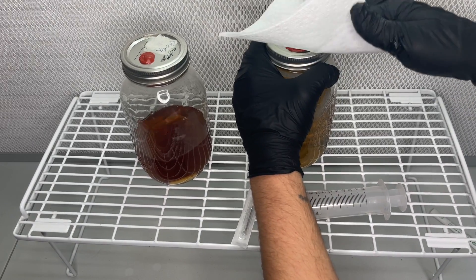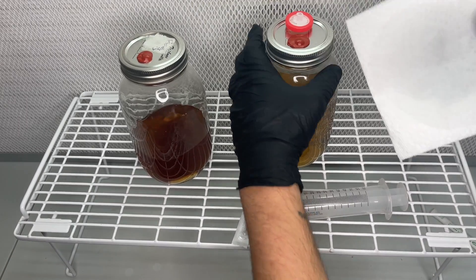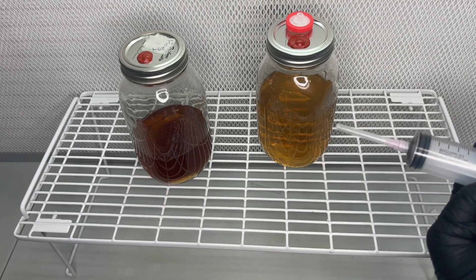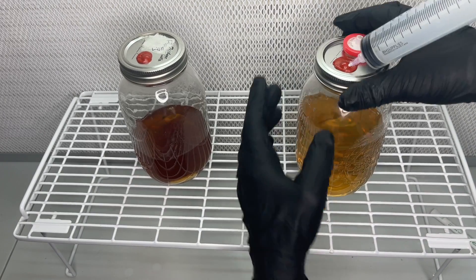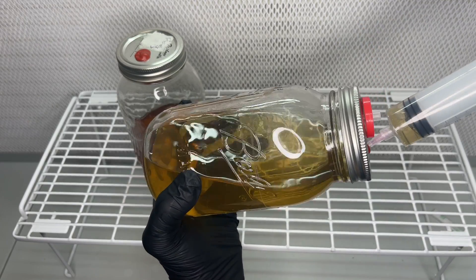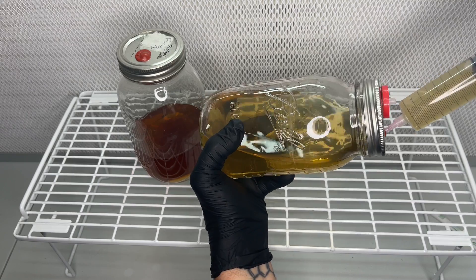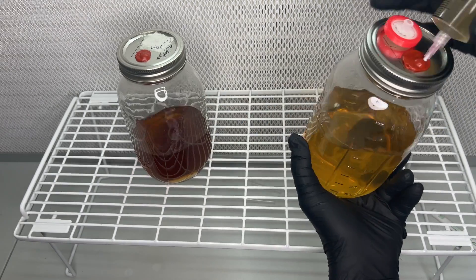Here is the fresh jar of honey water which you can see has a much lighter color. I used the same 60ml syringe and a new needle to extract the 240ml of fresh honey water and then inject it into the jar of stalled Lion's Mane Liquid Culture.